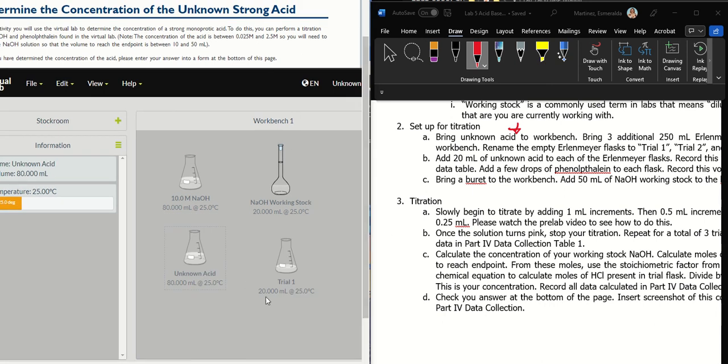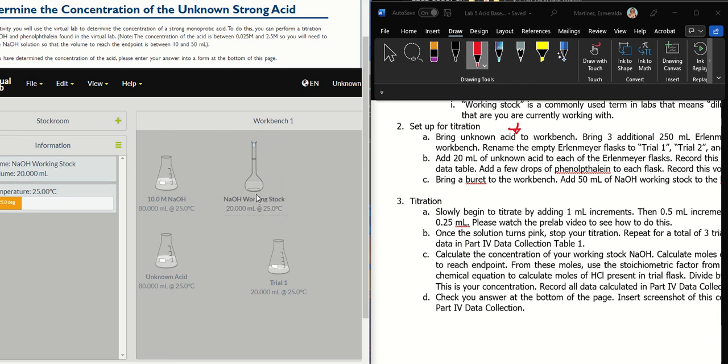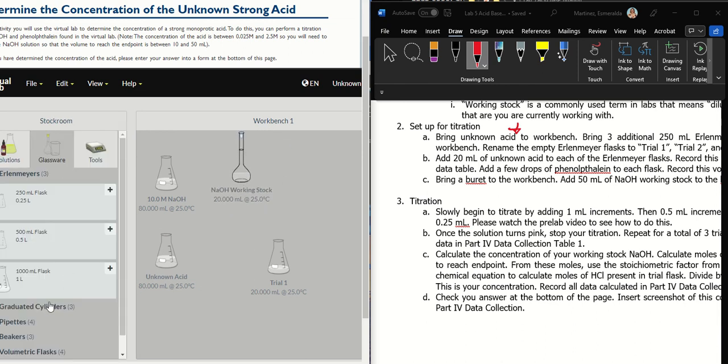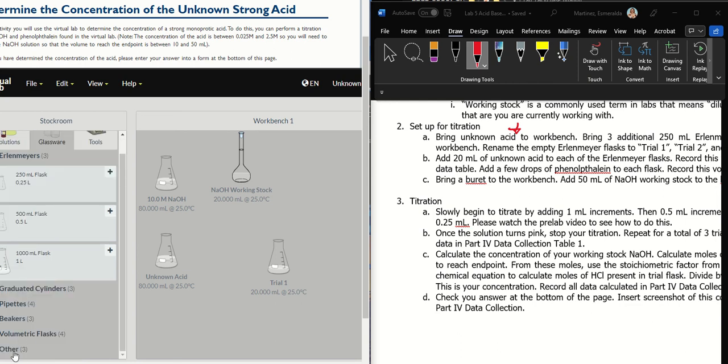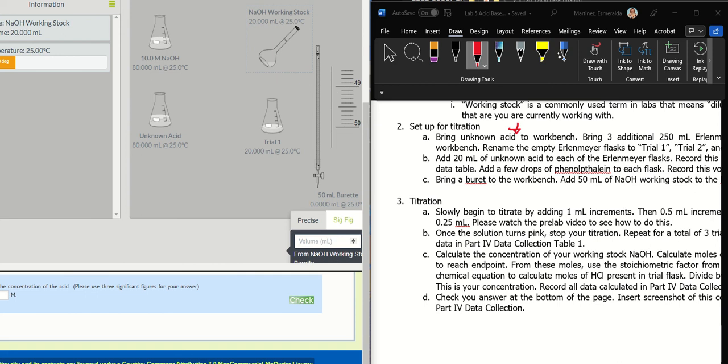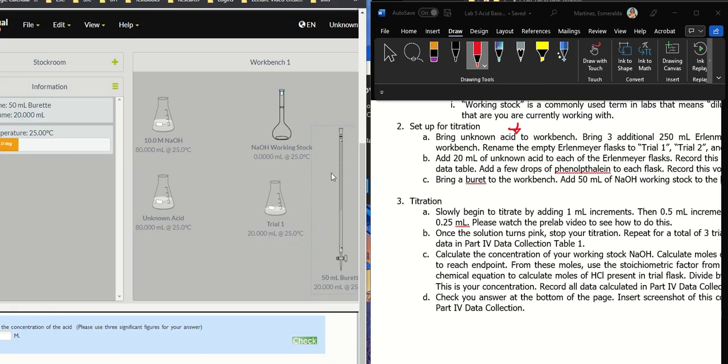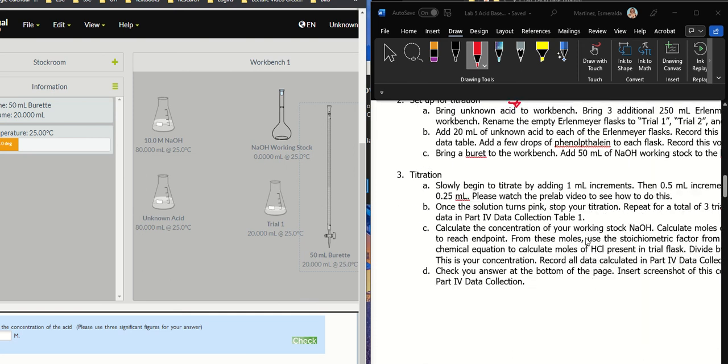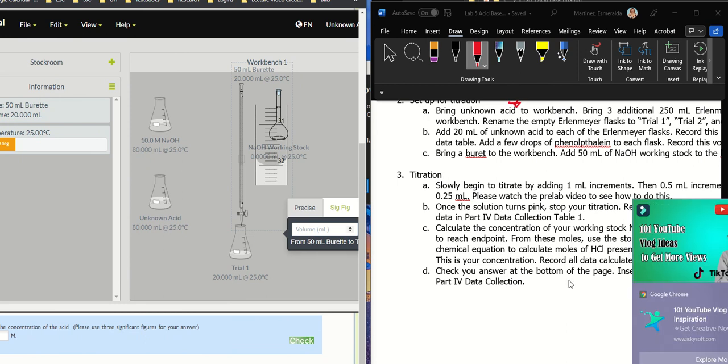Alright, so got it semi set up, right? I didn't actually do trial 1, trial 2. I just did trial 1. But as always, label everything. Have it clearly labeled out because everything can start to look alike, see? So let's pretend I made my working stock, right? Because mine is actually not made. But let's pretend I made it. And then you're going to transfer it to your burette. Alright, so we're pretending that I filled this burette all the way to 50 ml and that it actually contains the correct thing. It does not. I'm letting you do that on your own. But just to show you what this will look like. You're going to bring your burette on top of your trial.